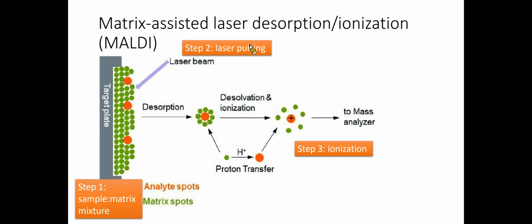Matrix-assisted laser desorption ionization (MALDI) is a technique for soft ionization in mass spectrometry that uses a laser energy-absorbing matrix to create ions from large molecules with minimal fragmentation. It has been widely used to measure the molecular weight of biomacromolecules such as peptides, proteins, nucleic acids, molecular weight distribution of polymers, and oligomer analysis.